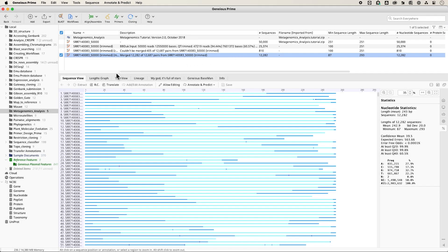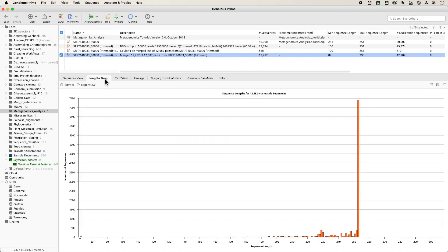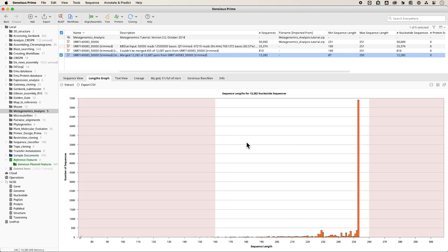Click on the file of merged reads and click the Length Graph tab. Here you'll see that a few sequences are much shorter or longer than the expected product size of around 250 base pairs.